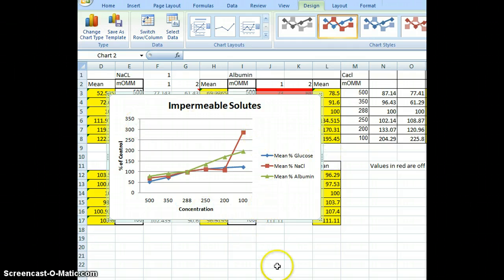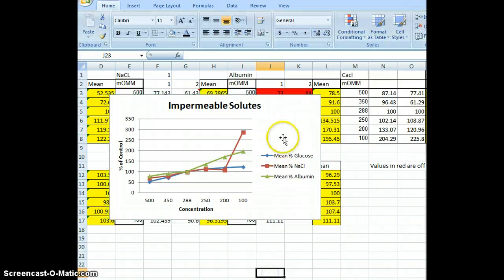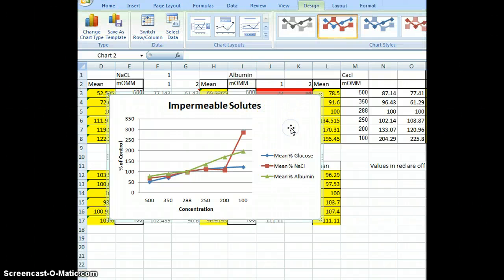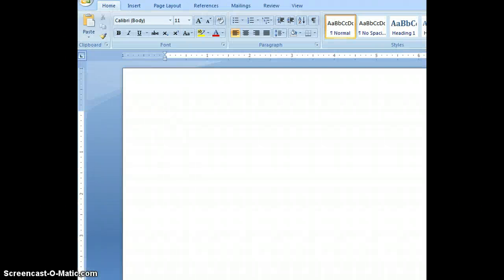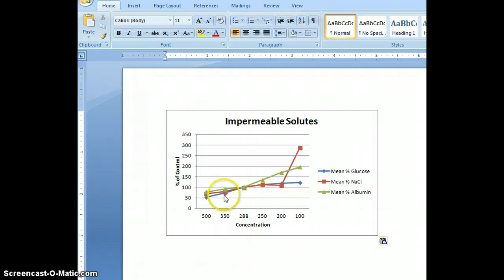Now we're ready to paste this into a Word document. I'll click anywhere in the white area of the chart, press Control+C, come over to Word, open a new document with Control+N, and paste with Control+V. And we have our chart.